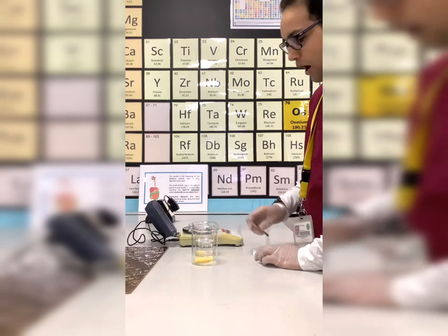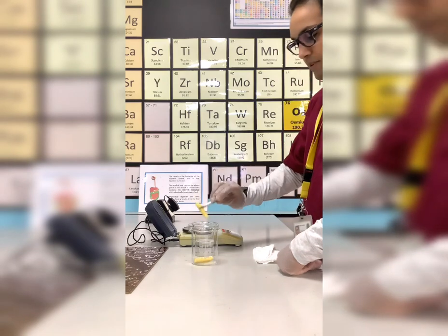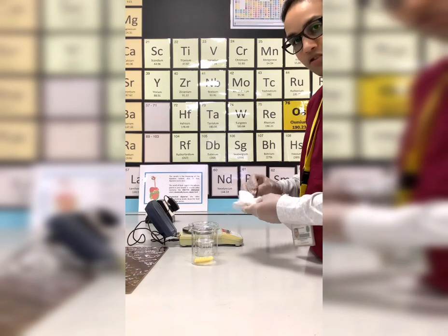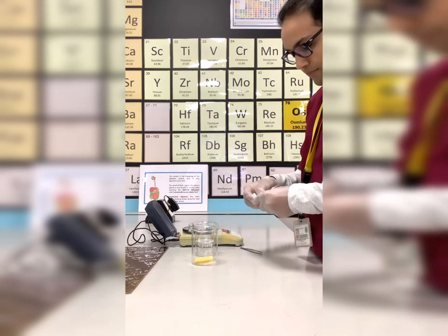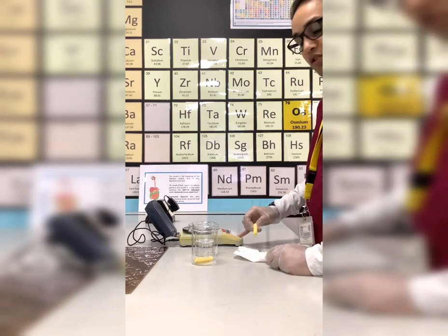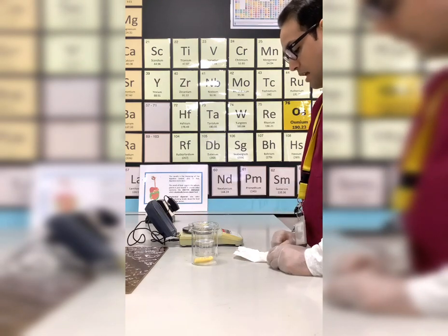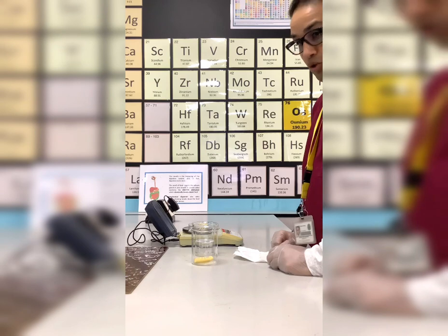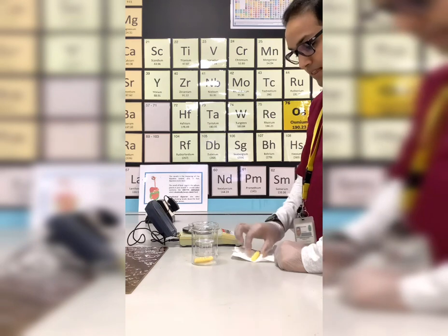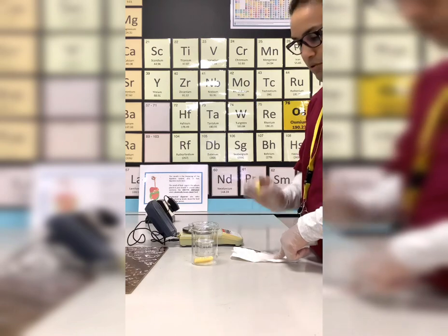So now after 24 hours, we can see the potato cylinders, what has happened to it. This was the potato cylinder which was in distilled water for 24 hours. I'm going to pat it dry using my paper towel and then check its mass. We remember previously that our mass was 5.35 grams. Let us observe today. The mass has increased to 6.27, so there is an increase in mass. So putting it in distilled water, the mass increases because the water got diffused in the potato cylinder.